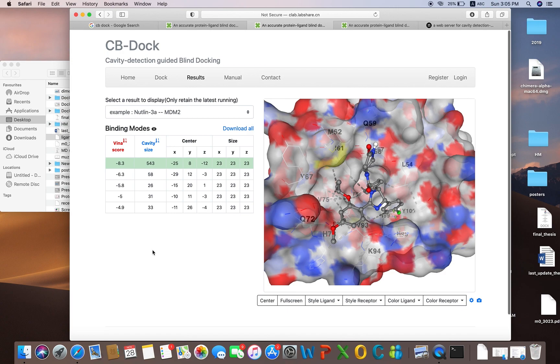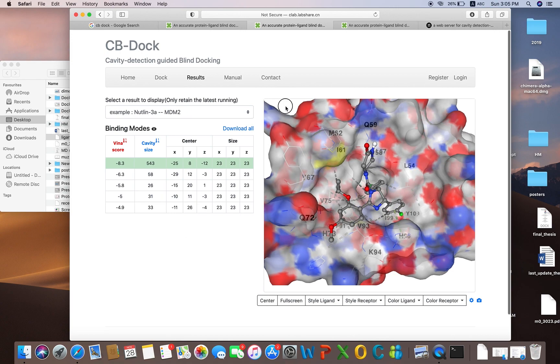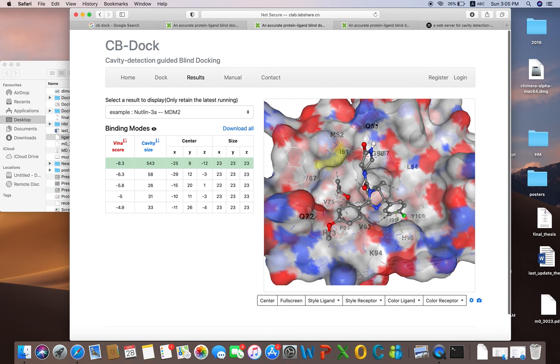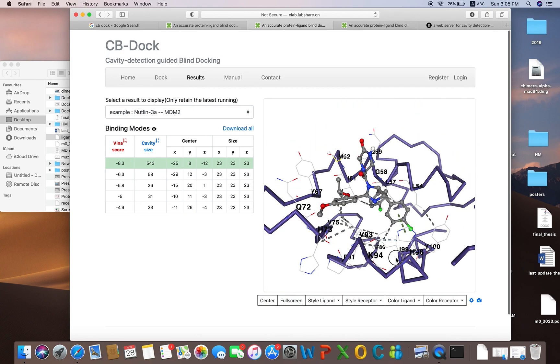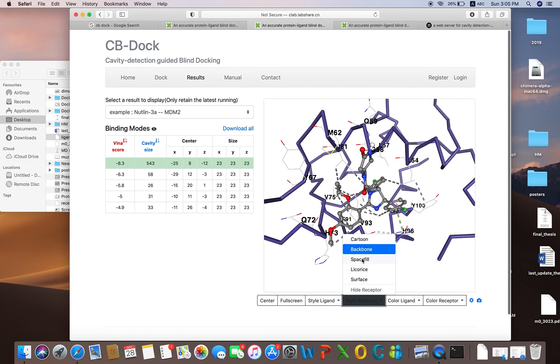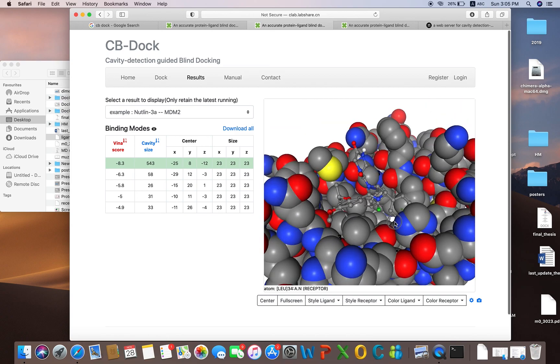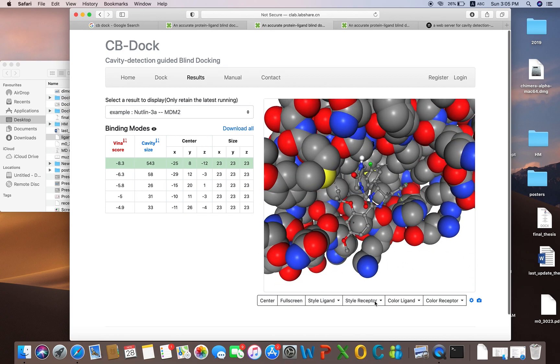You can find all information according to your protein. All interacting residues are shown, the score is given, the cavity size is given. The best score given here is minus 8.3. From here you can change the style of the receptor — this is the cartoon style, and if you are interested in the backbone it will show the backbone representation, or the space fill style.